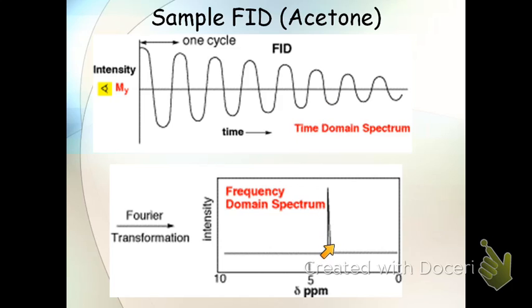There's a little bit of width here because it's not entirely a single frequency, but it's very close. Again, we got rid of the first part. This is the energy decaying, the resonant frequency leaving the sample, and eventually this will go back down to 0, in which case we could pulse it again and look at another spectrum coming out of the sample.